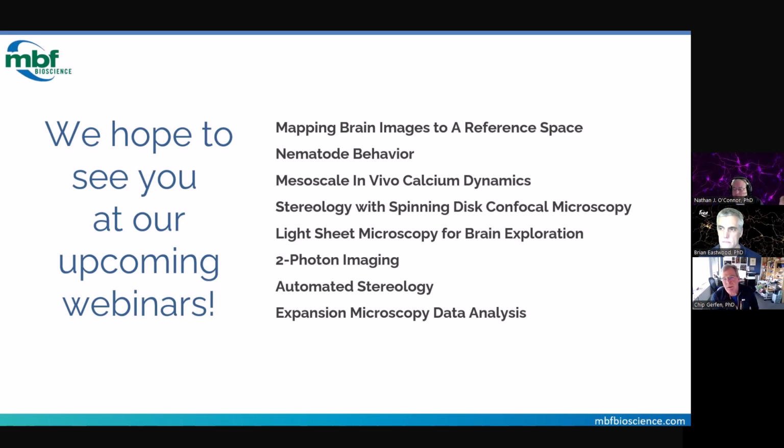Once we have imaged and brought it into the NeuroInfo program, what I showed today is basically the major manual part of it. It takes about 15 minutes to do the BrainMaker part, the manual part. Then the saving part takes about an hour on the computers we have.